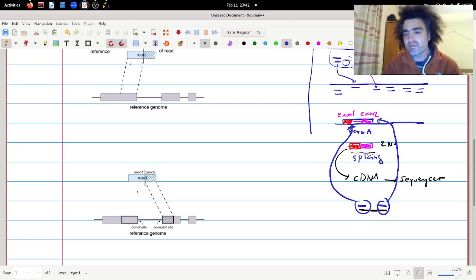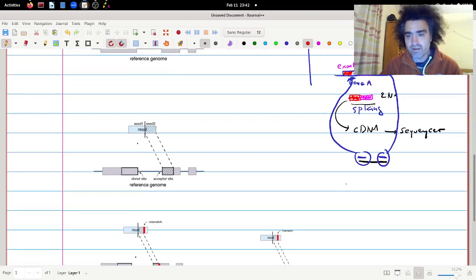So it's possible that we will not be able to map exactly the fragment. Moreover, it might be a bit more complicated than that because of the following reason. Okay, let's see that. It can be even more tricky. So again, I draw this here, a bit bigger.